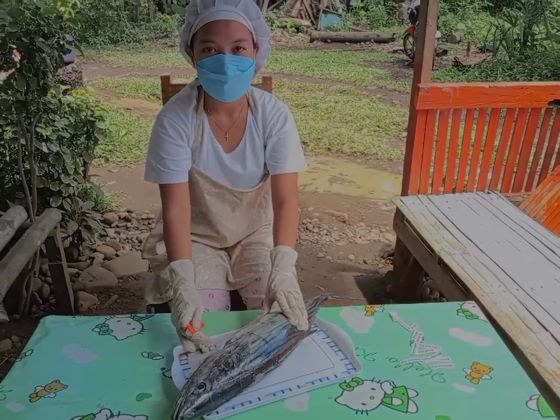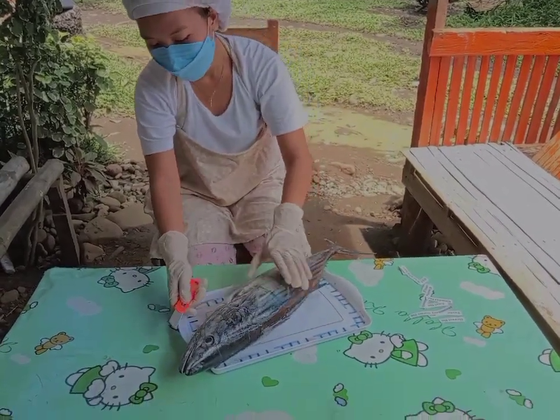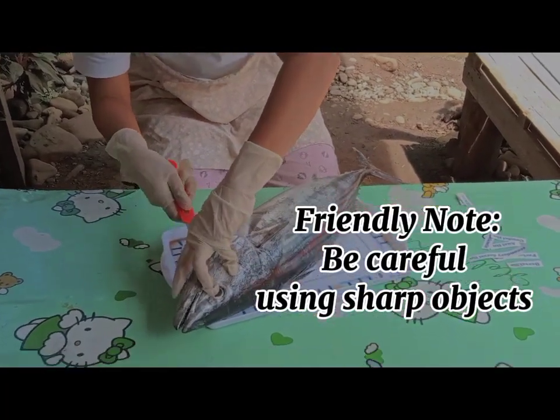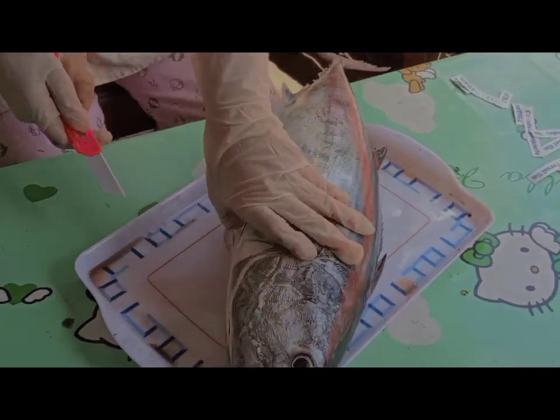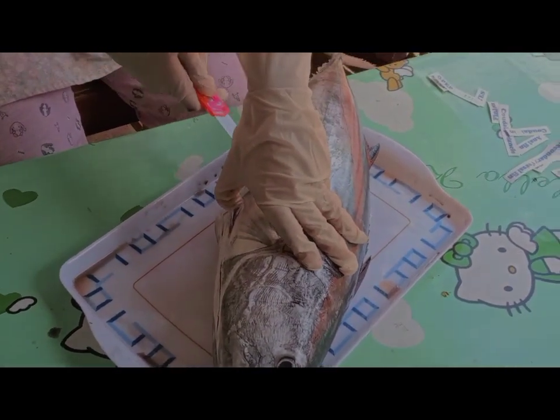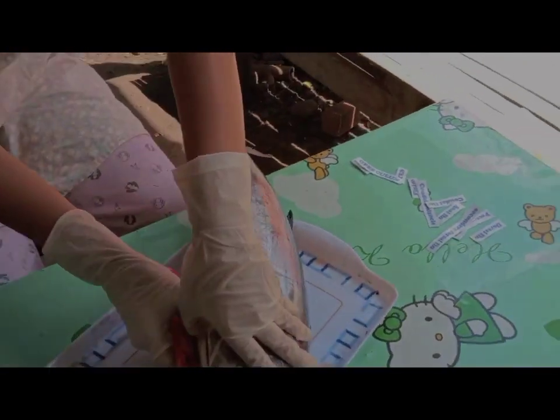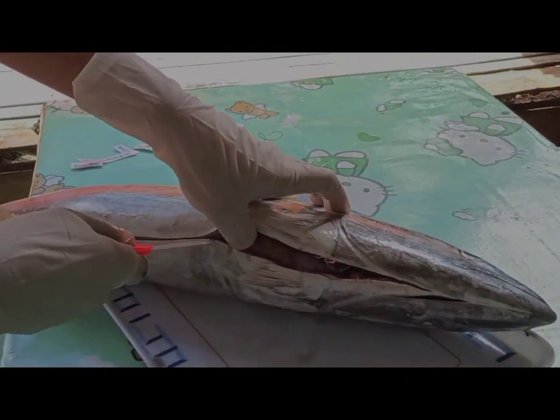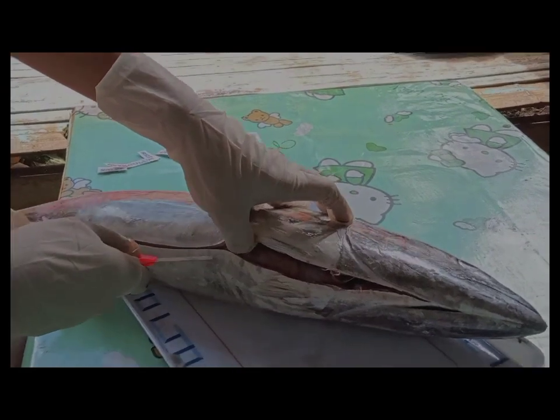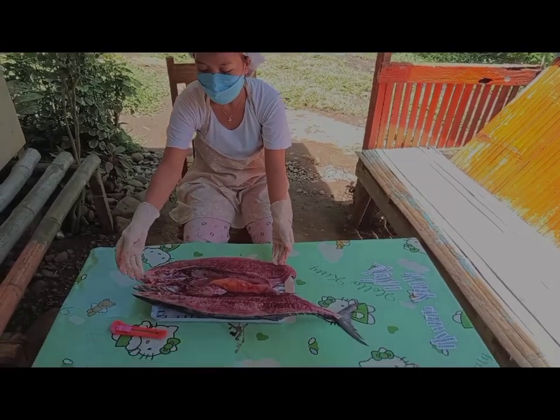And now, let us dissect the fish to see the internal parts of Bangkulisan. So here we go. This is the internal parts of Bangkulisan. Let's start with the tongue.